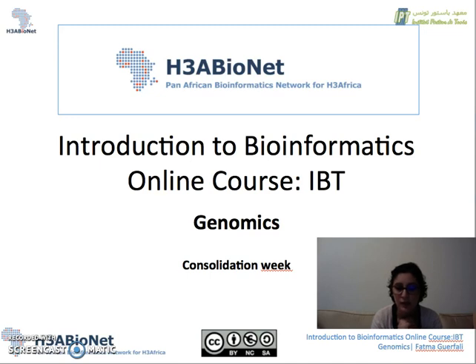So, by the way, this is a file that does not contain just any human genome. This is the mutations or small variants that have been reported for the Craig Venter human genome. If you remember, when I talked about the Human Genome Project, I also talked about a private project held by a private company that was meant to sequence the human genome. Craig Venter was the guy leading that company at that time. So this guy sequenced his own genome and he made the data available. What I've been selecting in this file are the small mutations that are related to chromosome 1, 2, and 3.